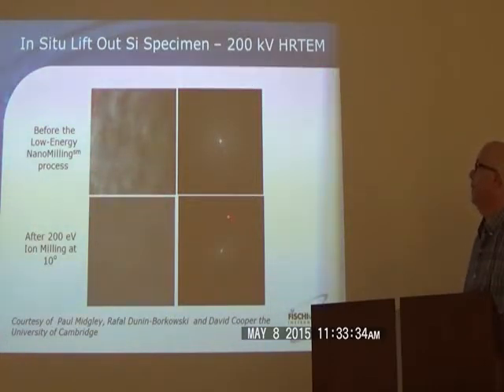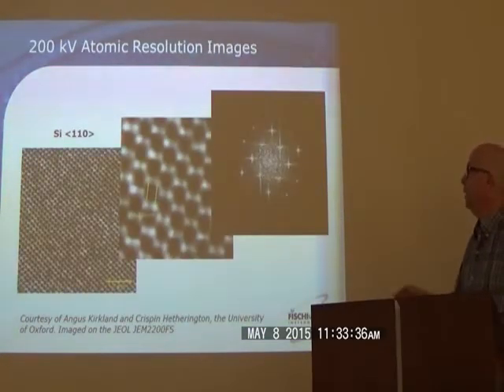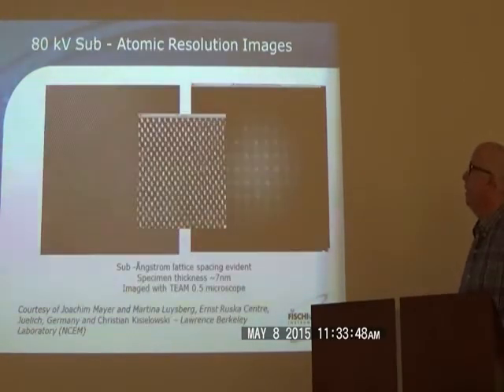Next slide. If we would go to a better TEM with that same sample, we could start to clearly see the atoms or ions in the silicon that make up the structure. And you can see you've got a lot more spots here, right? And out to a greater radius. If you go to the next slide, if you take a new piece of silicon, like these guys at Berkeley, and get it extremely thin and almost free of amorphization, this sample is actually 7 nanometers thick in this particular area. You have these really great images.